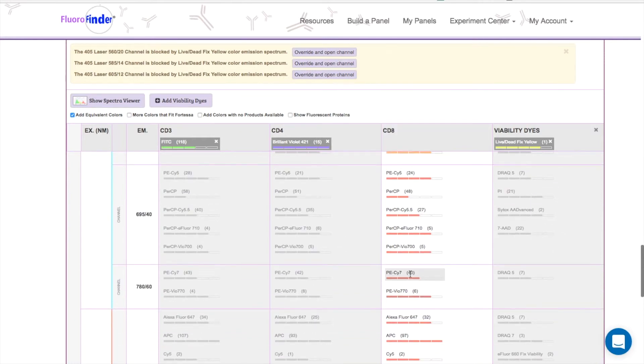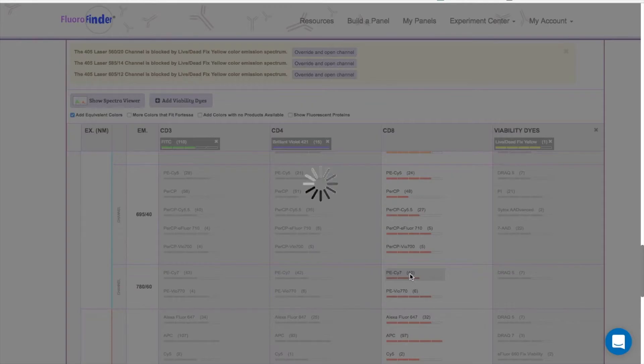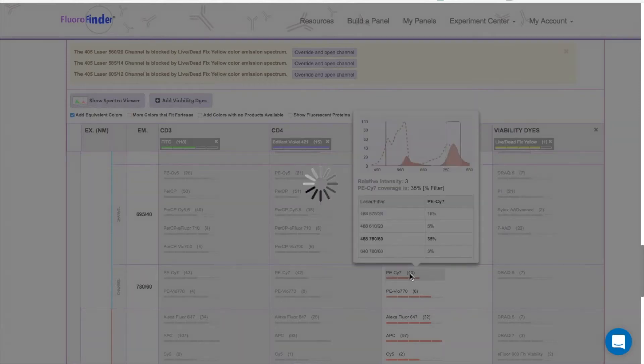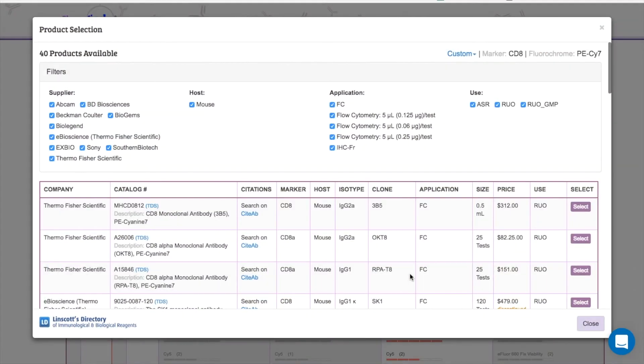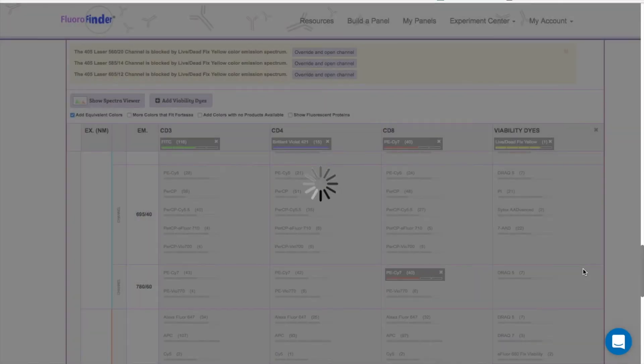This percentage is determined by how well the laser is exciting the fluorochrome, and how much of the emission curve is landing within this rectangle of the filter.